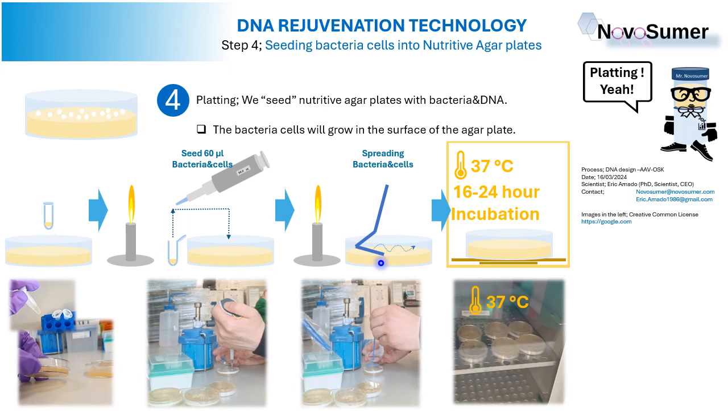The only thing that we have to do is slide this tool along the surface of the agar plates. By doing so, we are spreading the bacteria cells. Here you have a picture with the agar plates that have the 60 microliters on the surface, and this plastic tool is helping us to spread the bacteria cells on the surface.